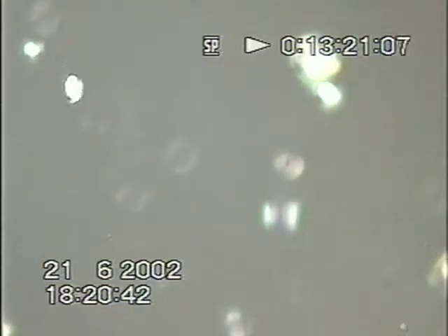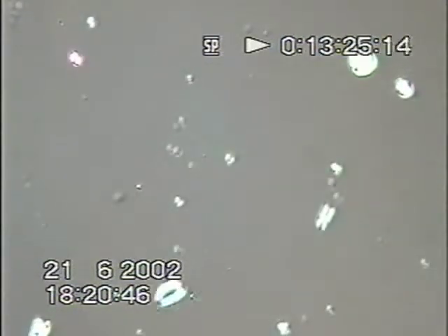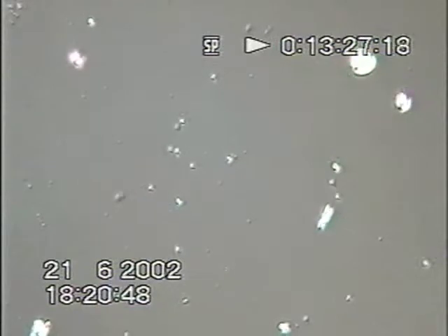Now here we have the 10 objective, and we've got a better, brighter, broader view. There's that crazy thing going on there. Now on the 10 objective we've got so much activity going on.